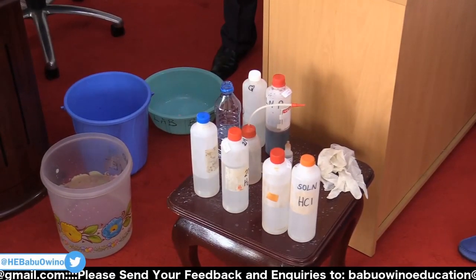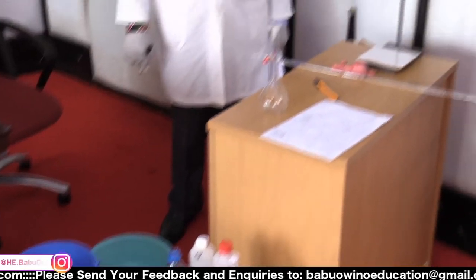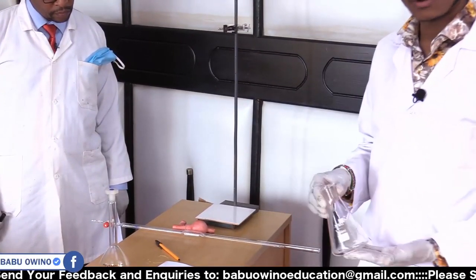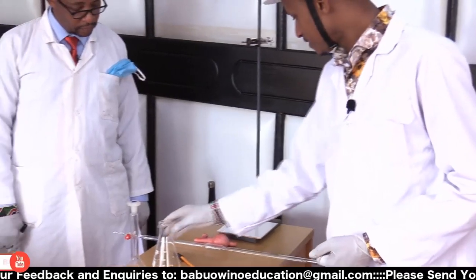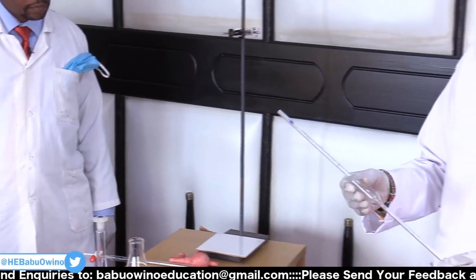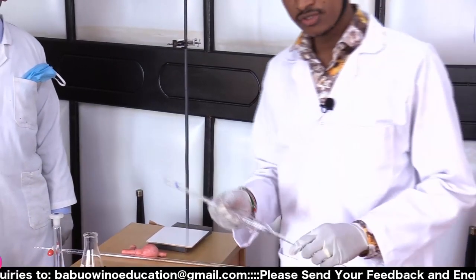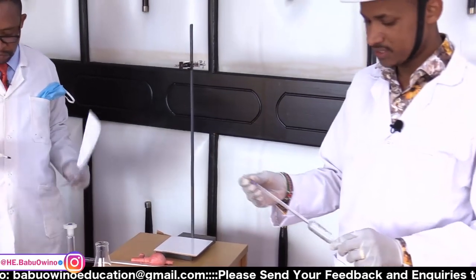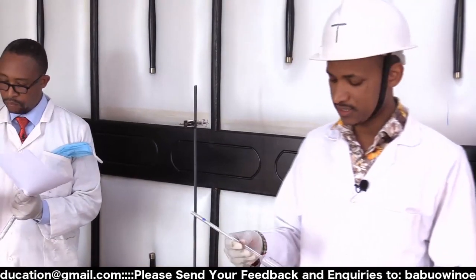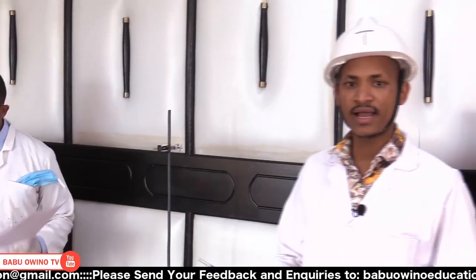Another apparatus that we have is the conical flask. This is where we will be mixing our solutions, in the conical flask. Then we have a pipette. The solution that we'll be using in the pipette is called the analyte.